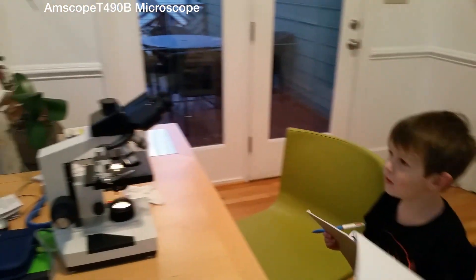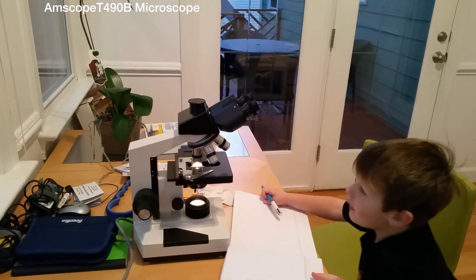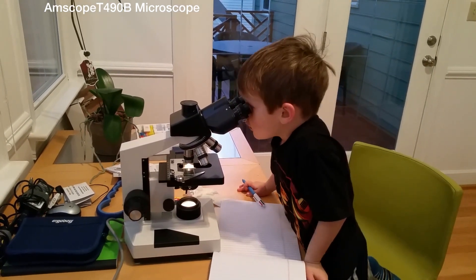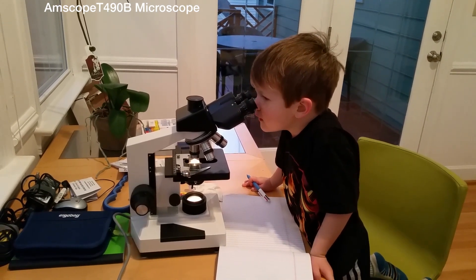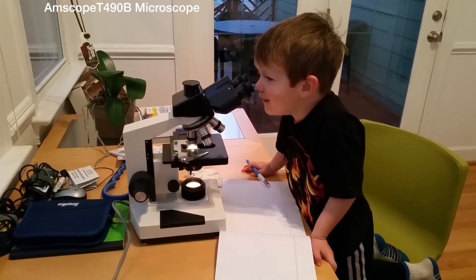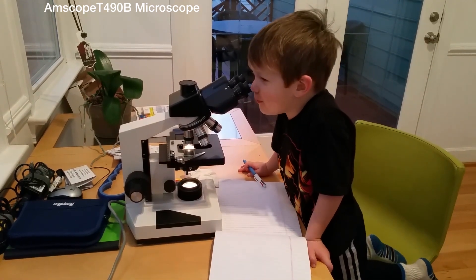Sven, take a look at 200 magnification here. The mold. What does it look like? It looks like poop.